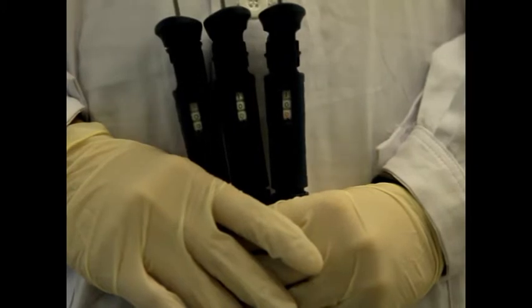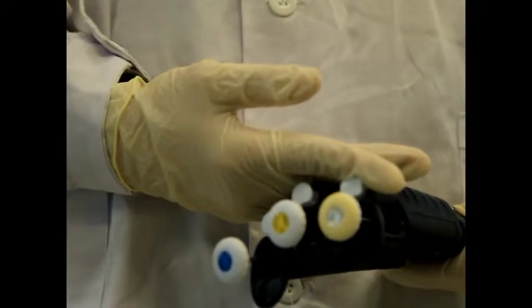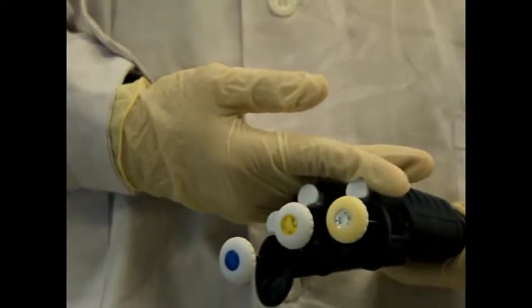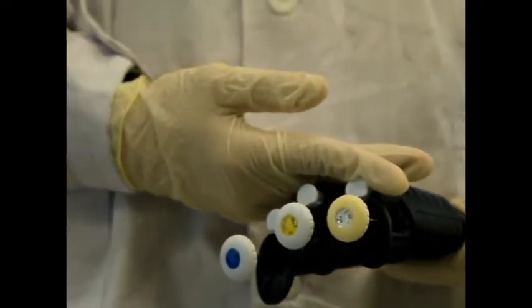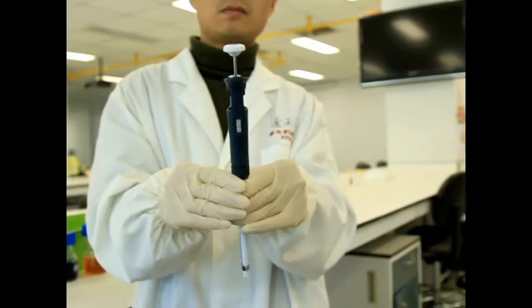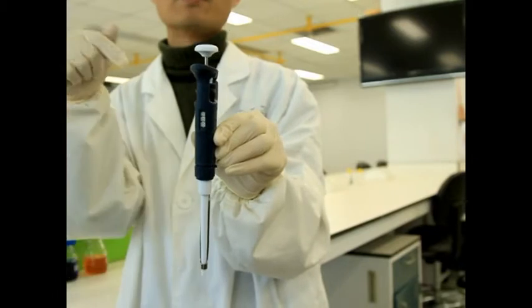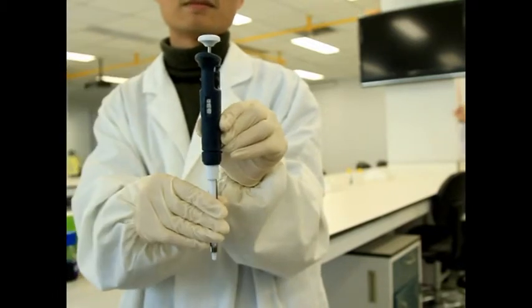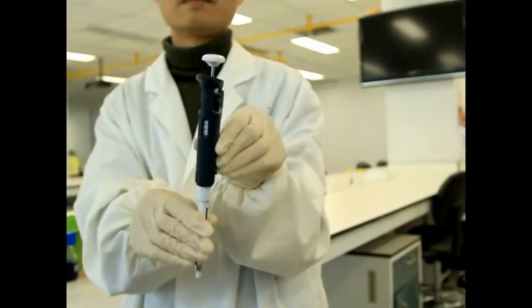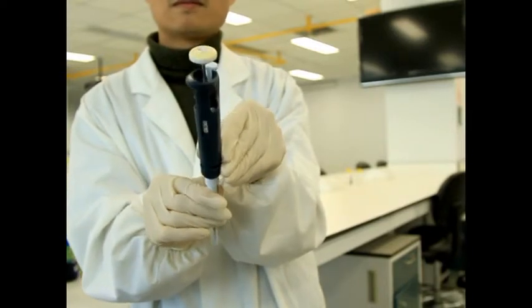A digital volume indicator has 3 digits. We can read the volume of liquid that we are going to suck up in the pipette. Different types of pipettes read differently. If it is P1000, it indicates that the max volume of this pipette is 1000 microliters. So this is 1000 microliters. If it is P200, it indicates 100 microliters. If it is P20, it indicates 10 microliters.